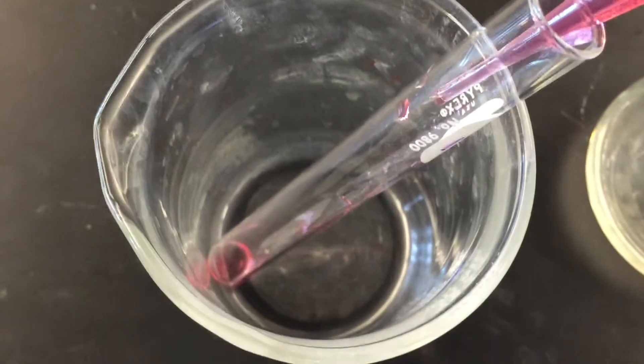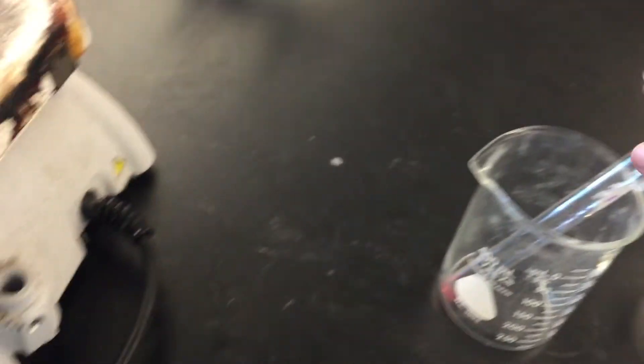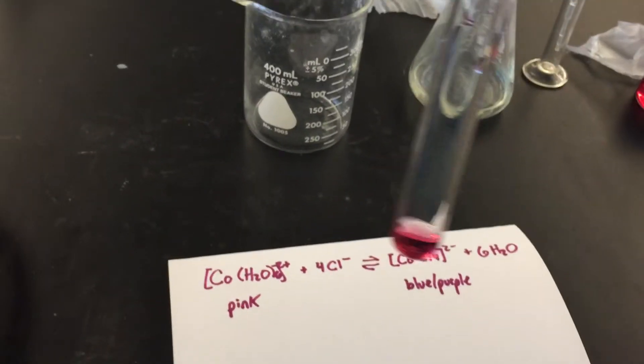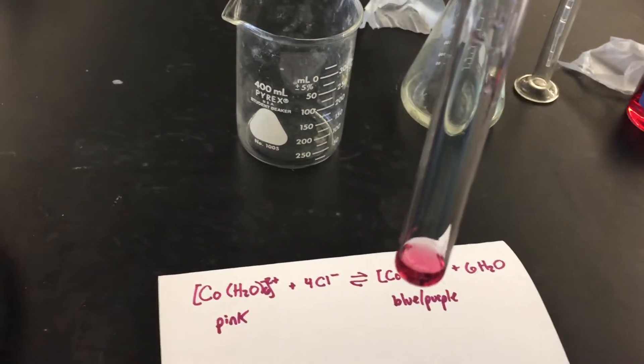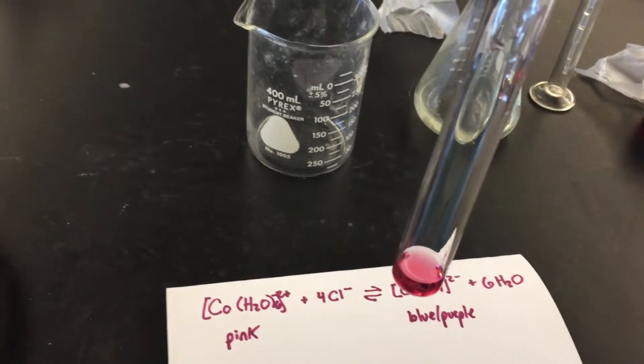That's probably enough. Inside this test tube, I now have my cobalt complex with a pink color. If I want to upset this compound, which right now is in perfect equilibrium, all I have to do is either add or take away something.